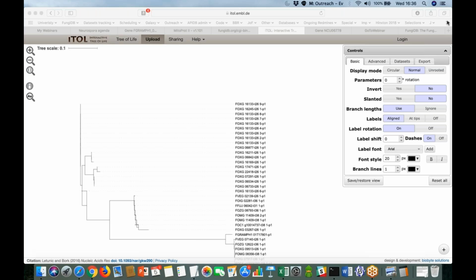The second thing to add is that, as Eve demonstrated, we're currently using ClustalW as the tool for alignment. This will change in the upcoming release, and we'll be switching to Clustal Omega, which is supposed to be slightly more robust in general, and in particular when you're doing a large number of alignments. But basically that'll be a minor change, which I think is a positive change.